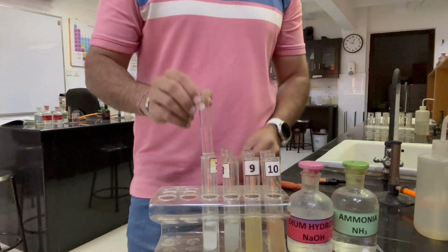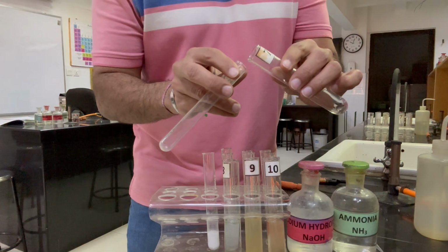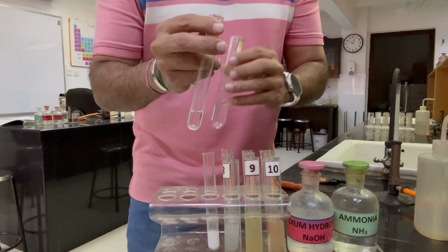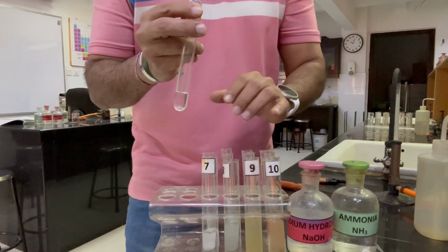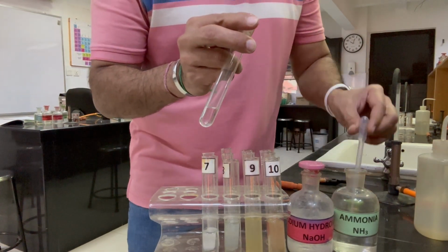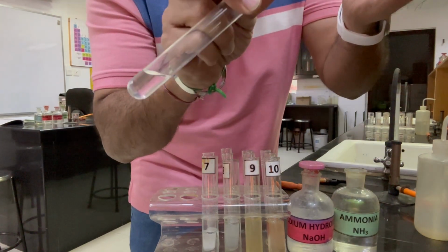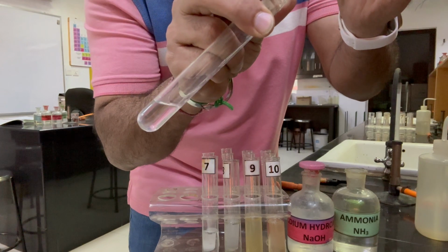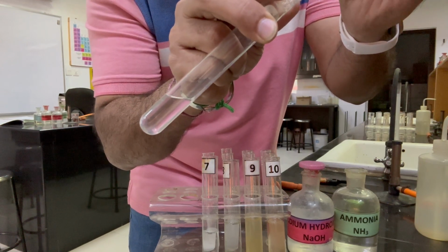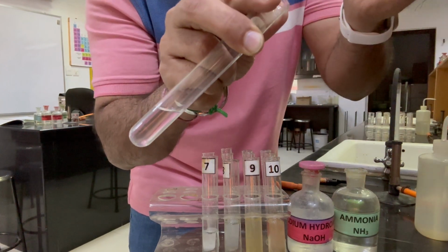Now we will take 1 centimeter depth of Fa7, and now we will start testing it with aqueous ammonia. So once we add a few drops of aqueous ammonia, we can see no change is appearing. If we even add in excess, no change, no precipitates.